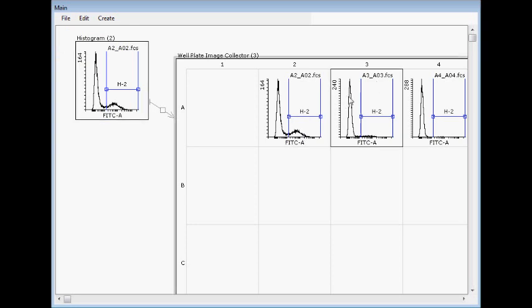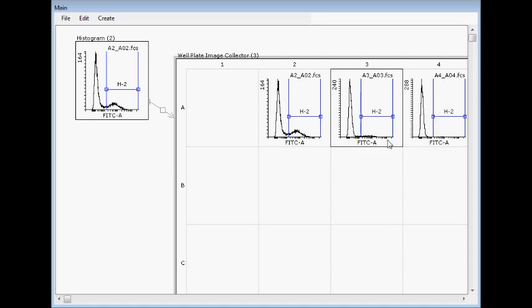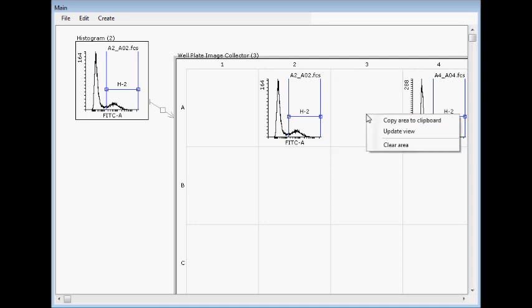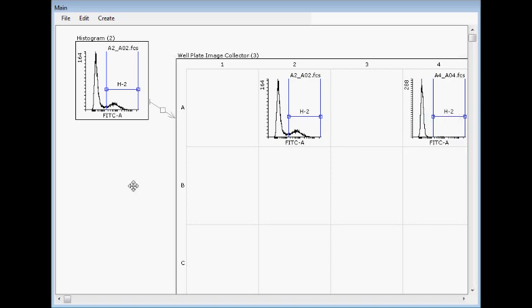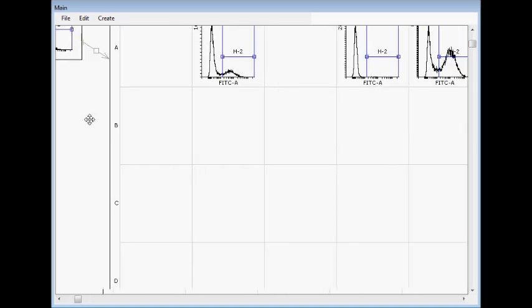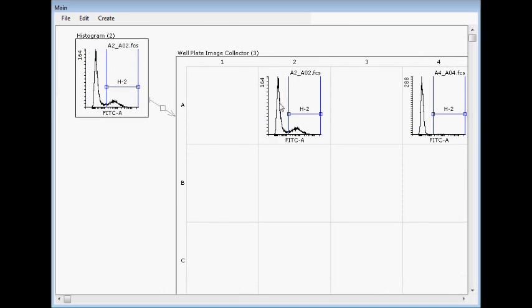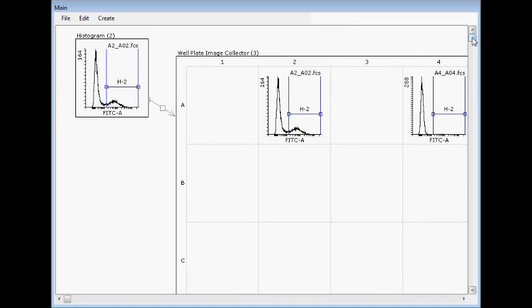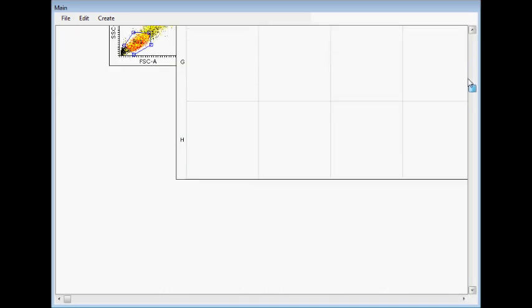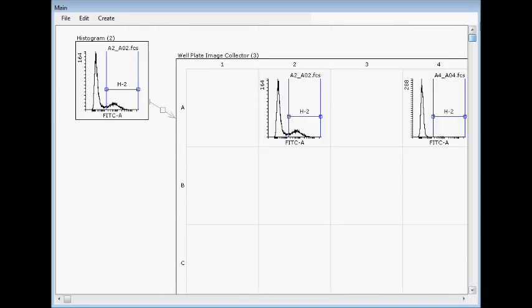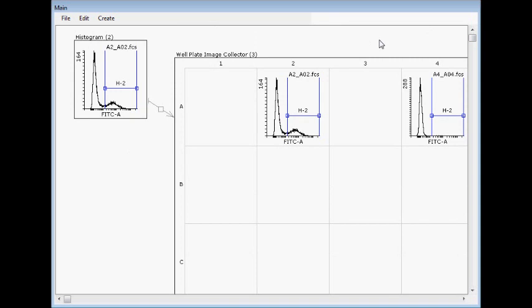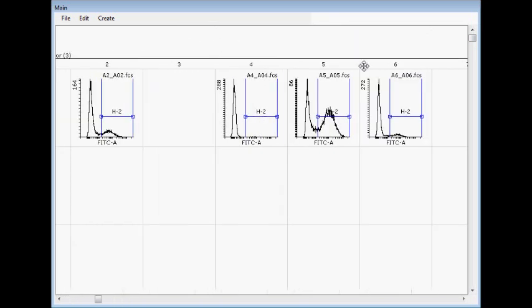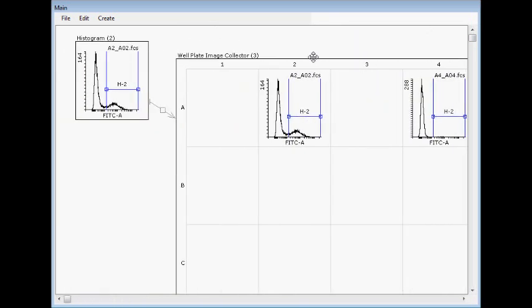If this is unnecessary, this can be deleted. And if I select the copy area to clipboard, this whole image here will be copied. It's quite huge, but it doesn't matter. It can go here.